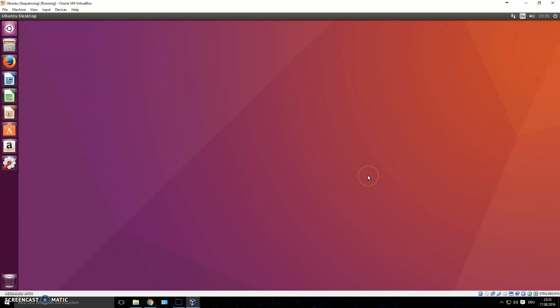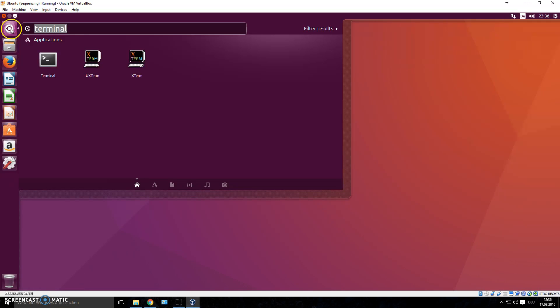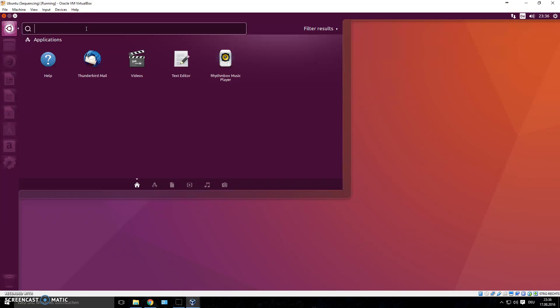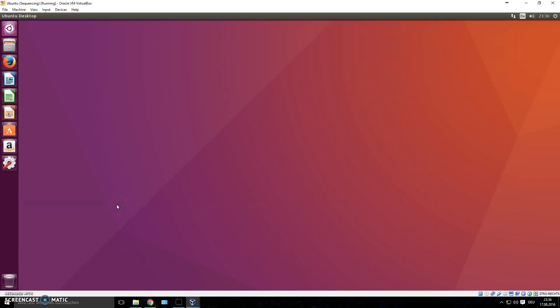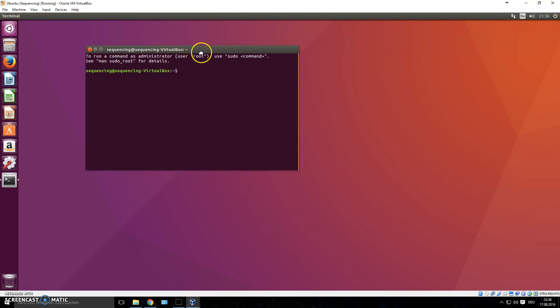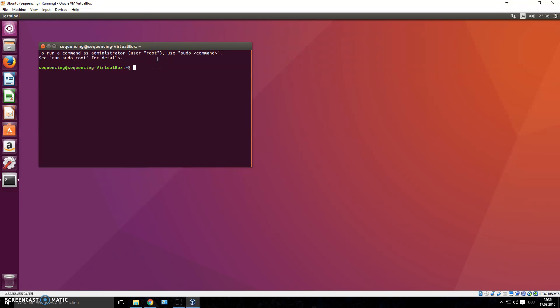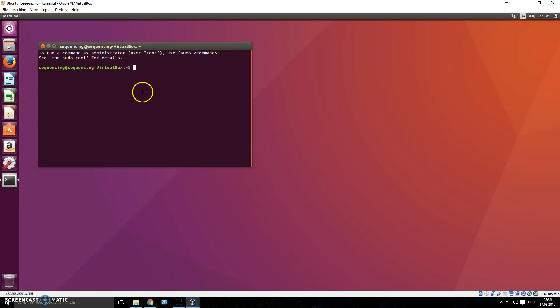We'll use the terminal to do most of our work. You can search for 'terminal' in the app launcher, or press Ctrl+Alt+T to open it. This is the command line interface — I'd describe it as the back end of your computer. You see the graphical interface with icons and drag-and-drop, but in the background a lot of code is being processed in something like this terminal. Knowing how to use it saves you a lot of time.